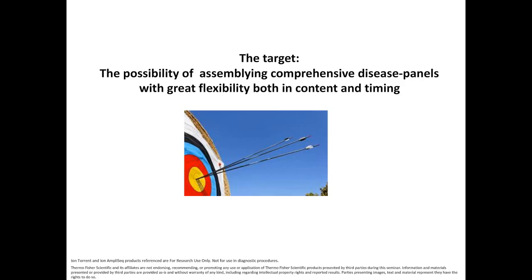Great, thank you. The next question goes to Alessandra. What are some factors to consider when choosing targeted panels other than what you already shared? Well, I guess one of the most important things now is to address the problem of depth coverage for two particular conditions, and one is somatic mosaicism, and one is probably gene dosage.